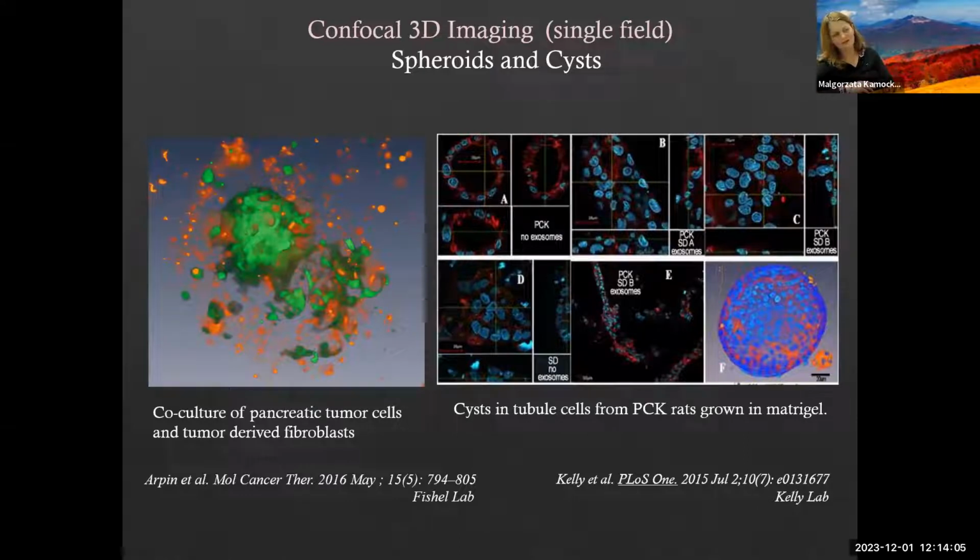which are in green. They are expressing GFP. Dr. Fischel was interested in tracking these spheroids over time to see how they respond to different anti-cancer treatments. You can really see very nicely how cells, cancer cells, which are marked in red color, disintegrate during successful treatment.